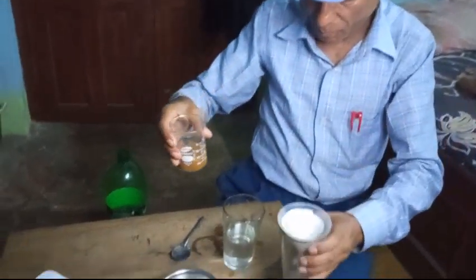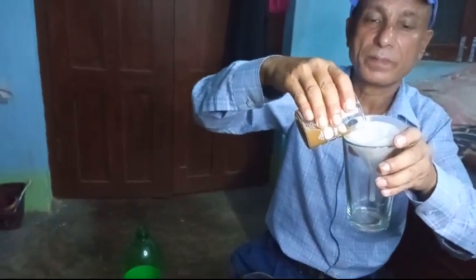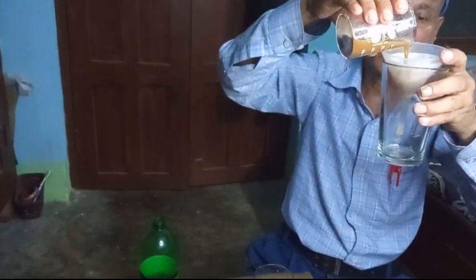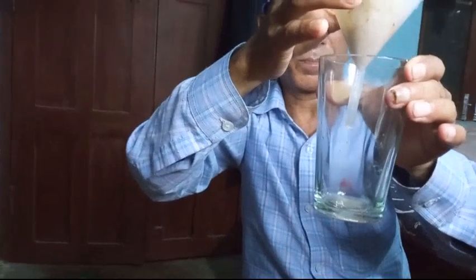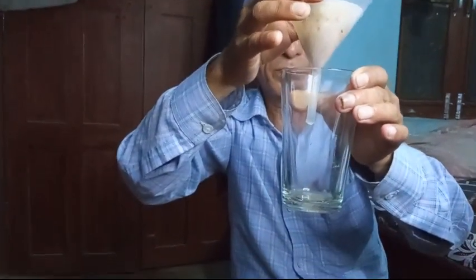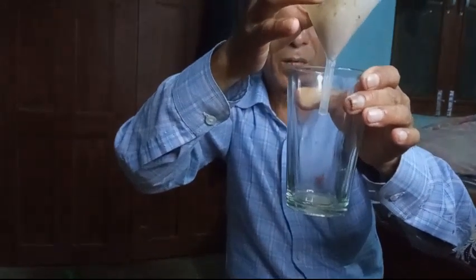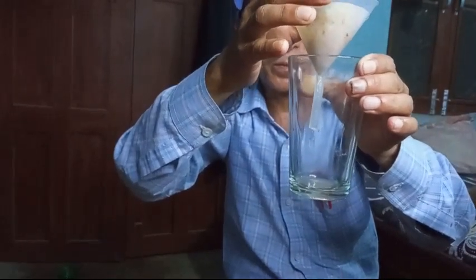Slowly, with the help of a glass rod, you have to pour it slowly, very slowly and gently. What happens? What will you get? Water. See, the filter paper. If you wait for some time, you can get pure or clean water.